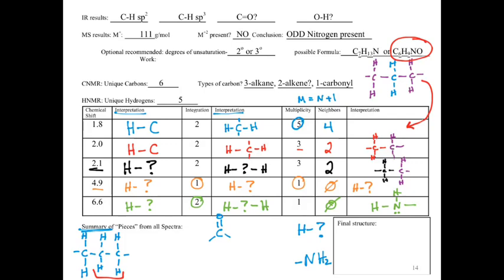First and foremost, they cannot have hydrogen attached to them. Period. We don't have a choice in that matter. There is no hydrogen attached. Okay? And because we don't know much else, what I would go through and do is just add these 2 carbons as extra pieces. Okay?